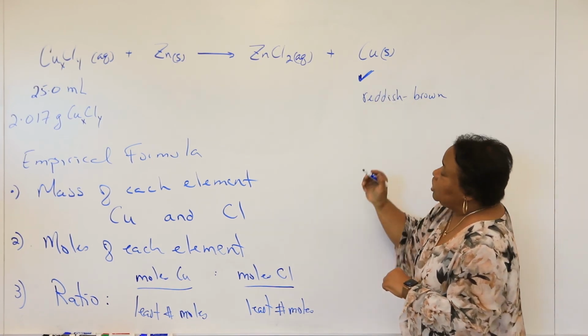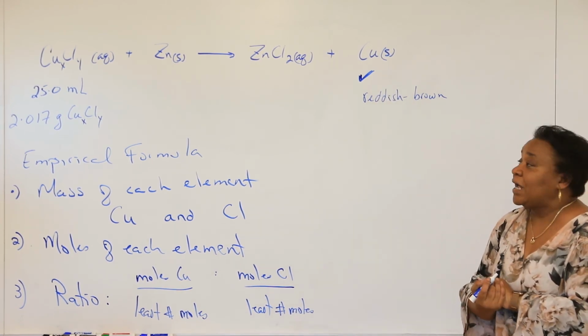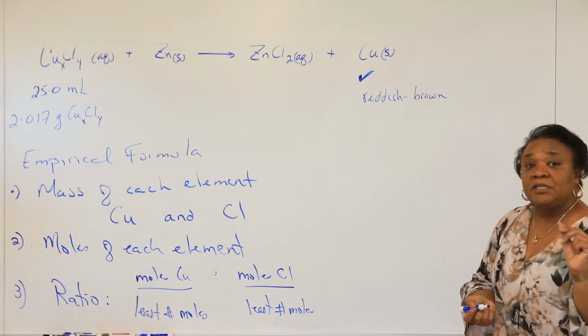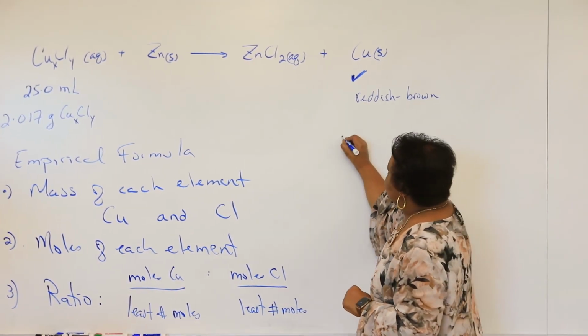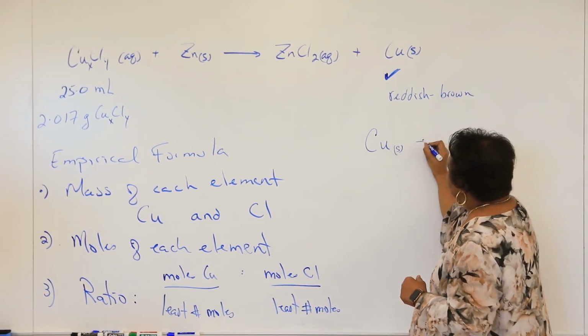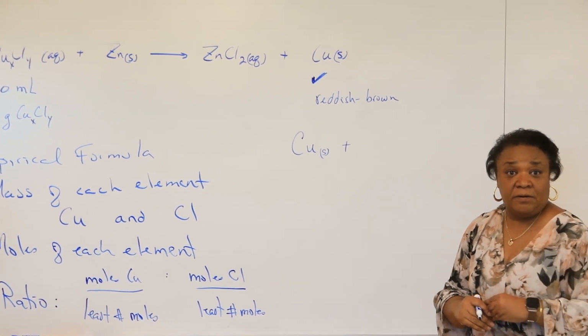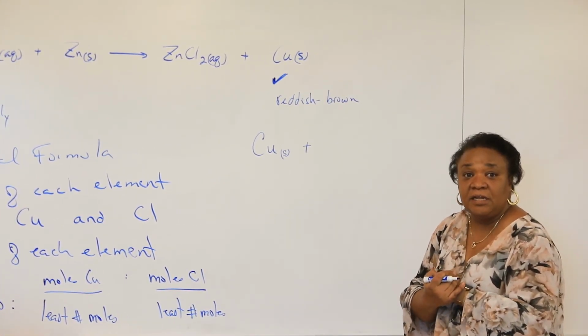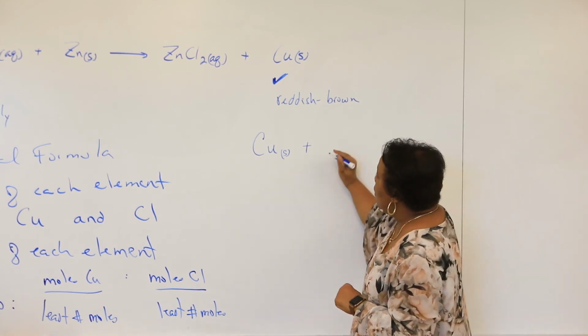And then the final challenge will be to recover that copper solid, and we also want to make sure that it's completely dry. But there's a challenge. Once we have obtained our copper, please note, it's going to be dried by heating. However, we need to make sure that we're just gently heating this copper metal. And here is why.